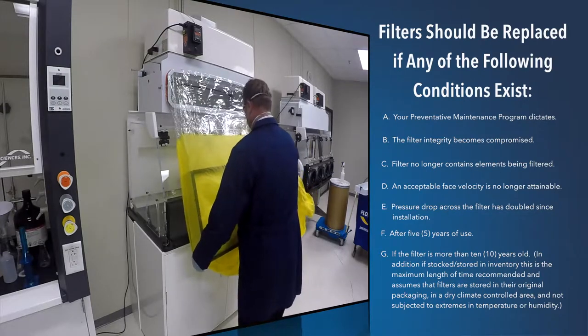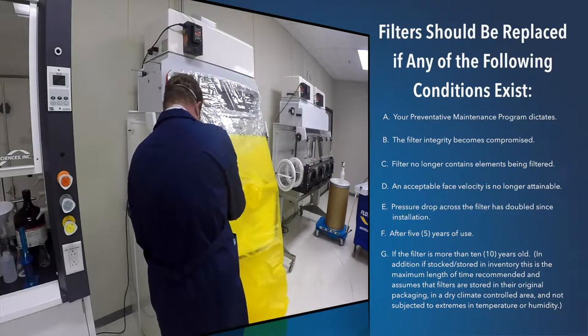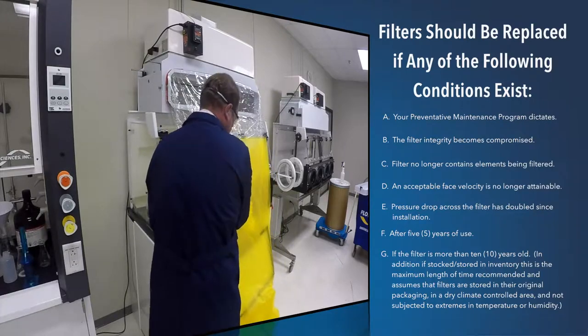G. If the filter is more than 10 years old, including time stocked and stored in inventory. This is the maximum length of time recommended, and assumes that filters are stored in their original packaging in a dry, climate-controlled area, and not subjected to extremes in temperature or humidity.